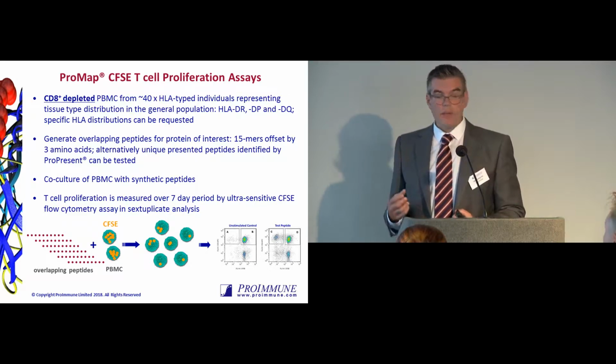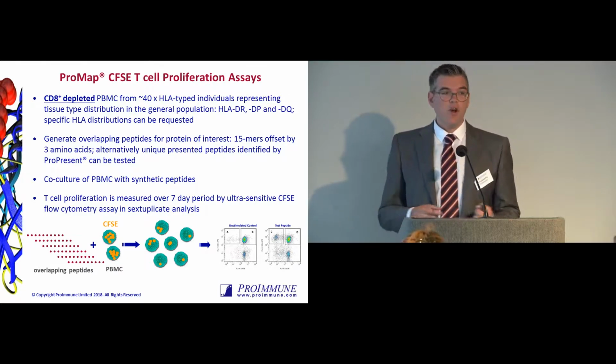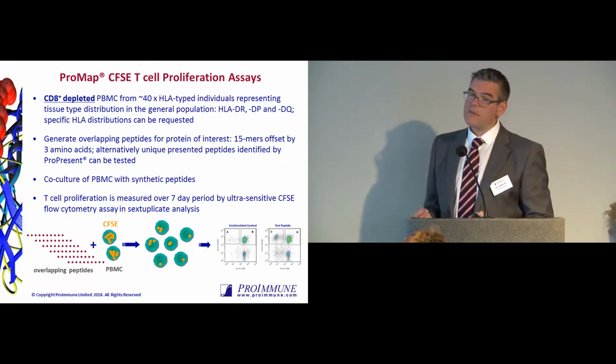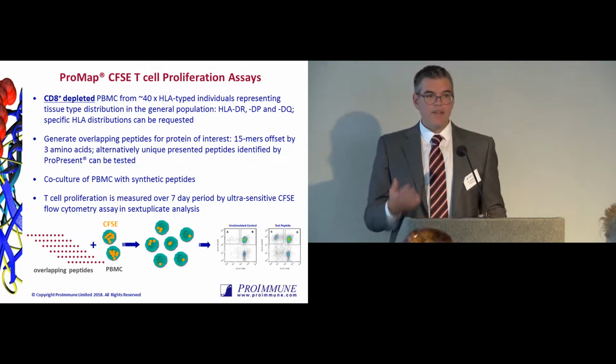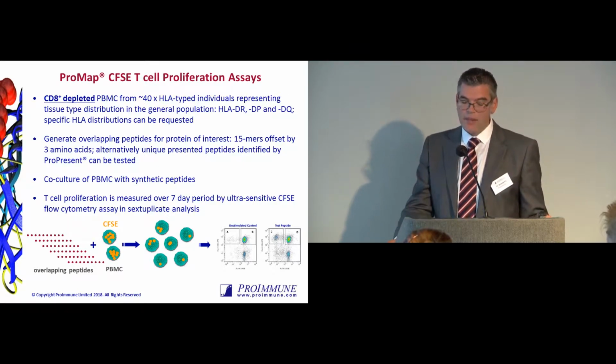The other point where you can use these sorts of assays are over specific engineered regions, whether that's a potential neoepitope that's been introduced at a junctional region, or whether that's specifically over the CDRs of a monoclonal antibody. Again, there are many, many different circumstances when you might want to run these particular types of assays.